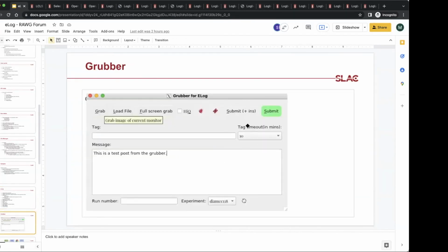Each instrument has its own instrument log. When you submit the log statement, you can submit it both to the experiment log and to the instrument log. This is to notify the instrument scientist of some problem, feature, issue, whatever. So you're basically making two statements: one in the experiment and one in the instrument log. A lot of folks, at least the instrument scientists and controls folks, whenever they log in, they just look at the instrument log to see what happened on that instrument. Let me go back to my log here.